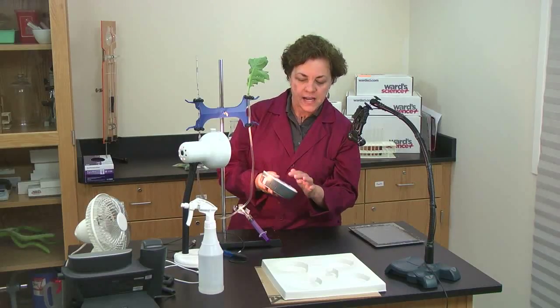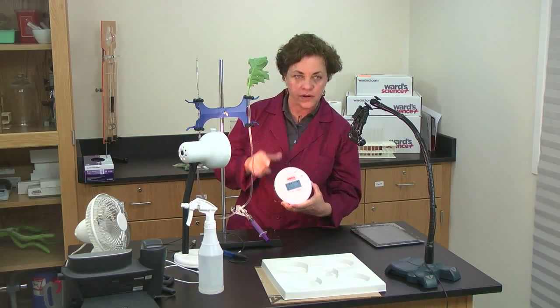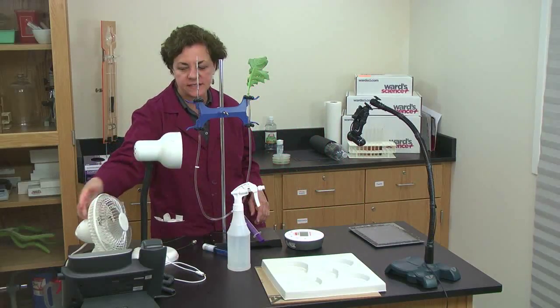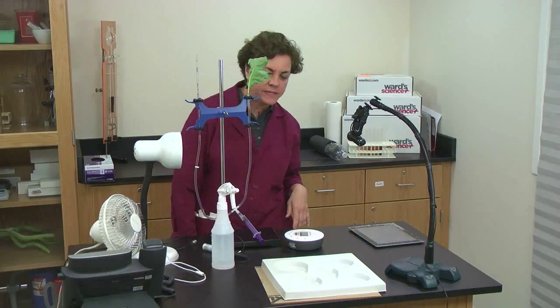Then also the readings are not only on the graph, but they're also on the readout on the Datahub. You could have one group testing the light. We could test a fan. We could test the sprayer to increase the humidity.